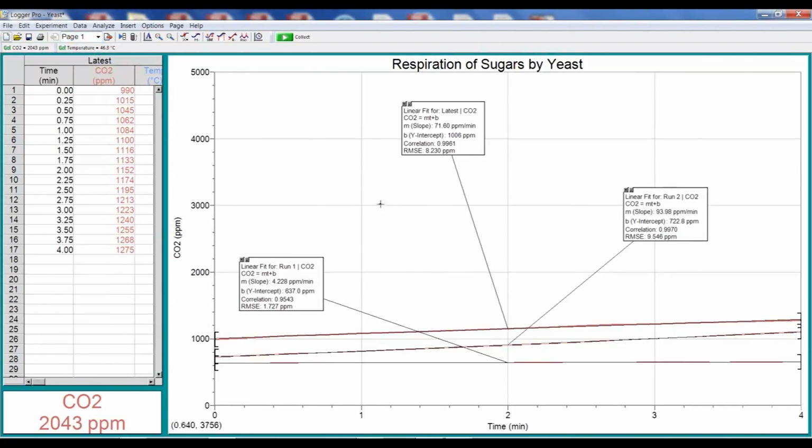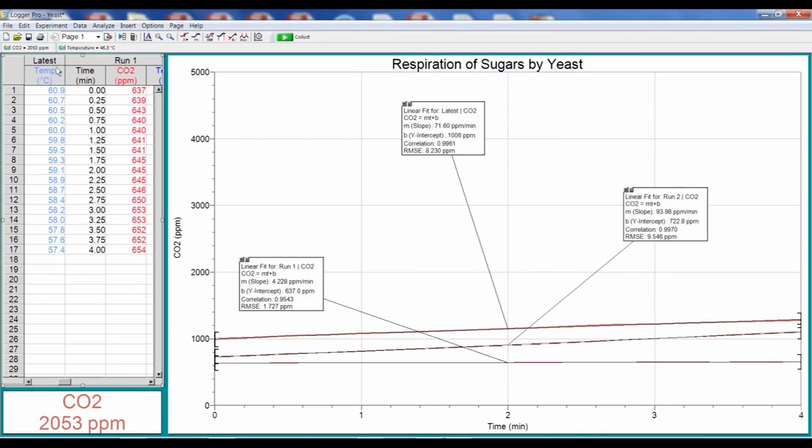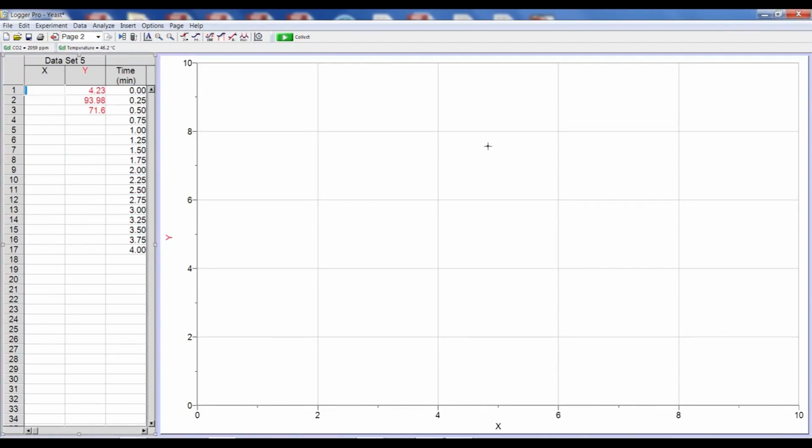And for temperature for cold, warm, and hot water, I will again obtain information from here. The latest run was hot water, and the temperature for it is around 60 degrees Celsius. I'm going to select 59.1 since it fluctuated and it's the number in the middle. I will select that number as the representative of the temperature. 59.1 for the hot water.